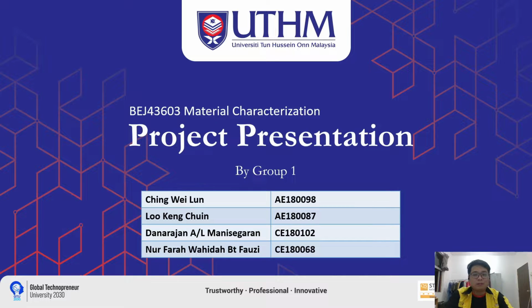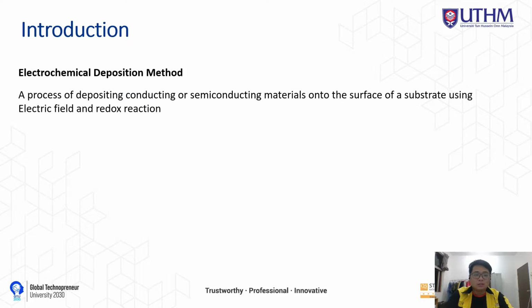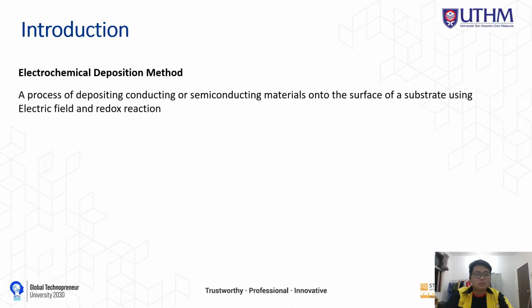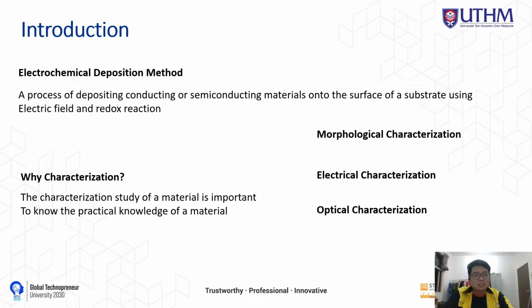So let's start with the introduction of this project. The deposition method we chose to review in this project is the electrochemical deposition method. This is the process of depositing conducting or semiconducting material onto the surface of a substrate using an electric field and redox reaction.